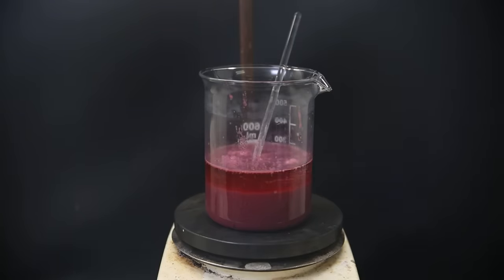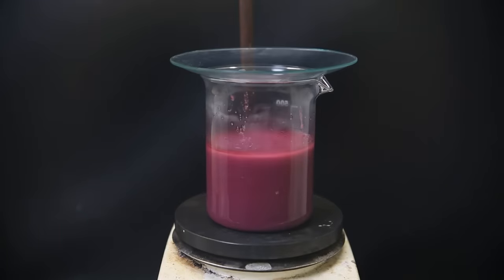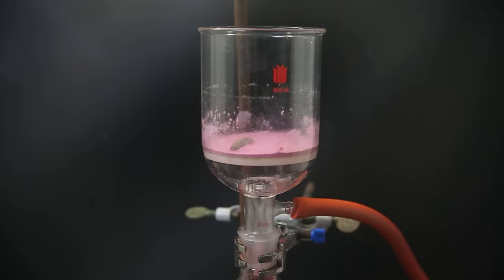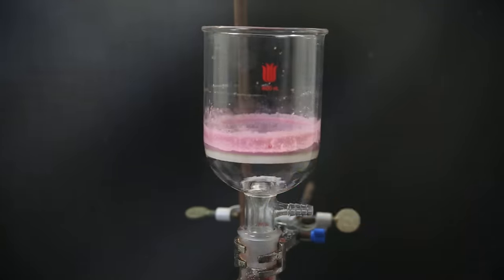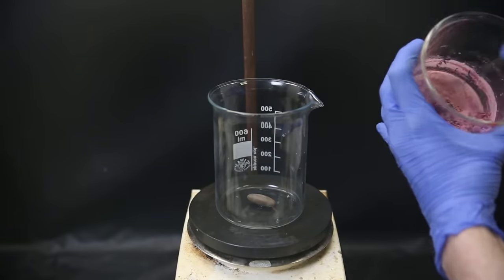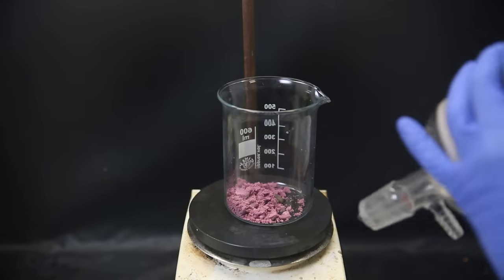I move it all to a beaker. I wash out the flask with more acid and then let the mixture stir for a few hours to make sure everything has reacted. I then vacuum filter it all through a glass frit to collect the pink solid and wash it with some water. I then scrape off all of the solids from the filter and move it to a beaker.